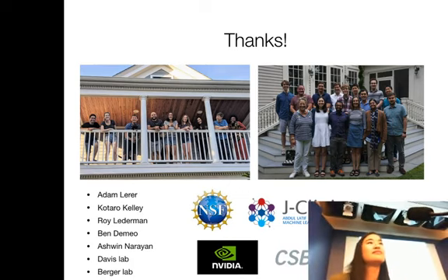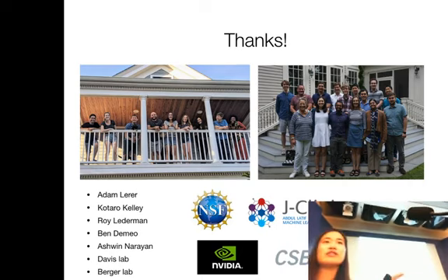Differential, what, pardon? Like ray tracing for images, right? Where you have a volume, but then you generate the image through it and can differentiate through it. Have you thought about anything like that for encoders so you can model the projection correctly? So the image formation model is slightly different. The images are actually projection images, like integrals through the density along the imaging axis, whereas in other domains of 3D shape reconstruction and computer vision, they're surfaces where you have this ray tracing. So I'm not exactly sure how that would apply; we already directly model the image formation process by treating our images in Fourier space as slices of the volume.